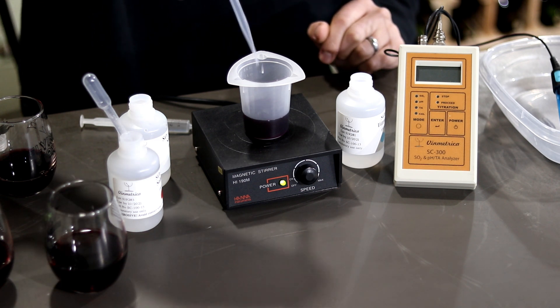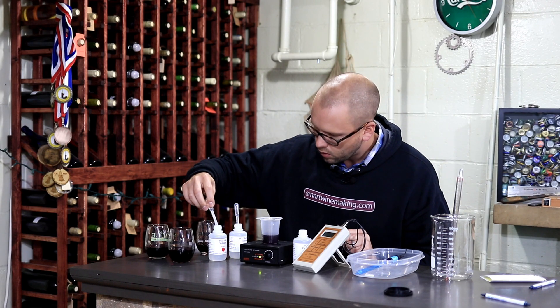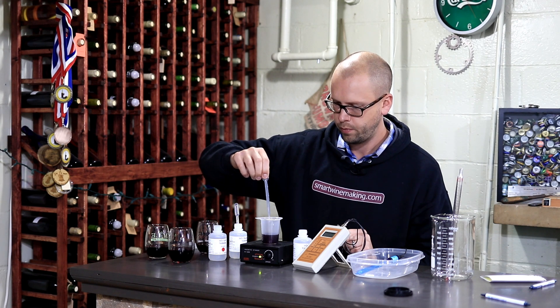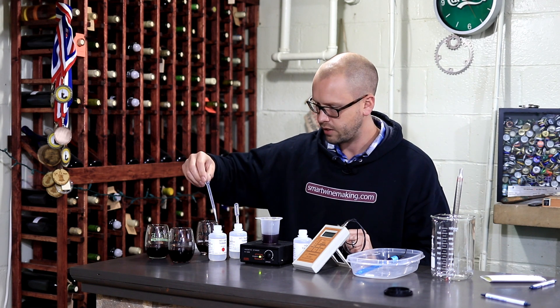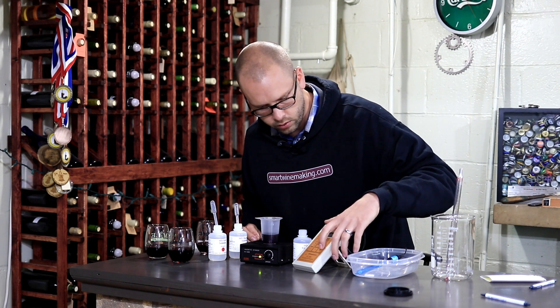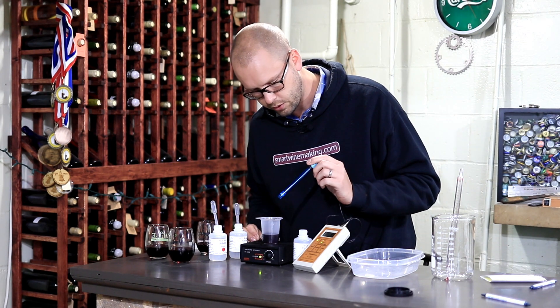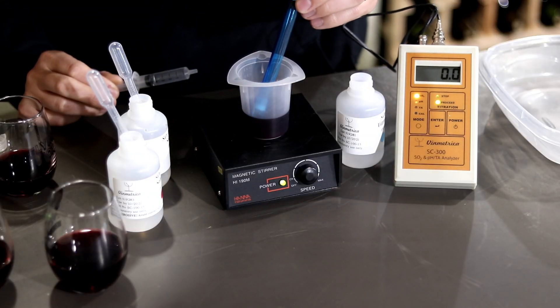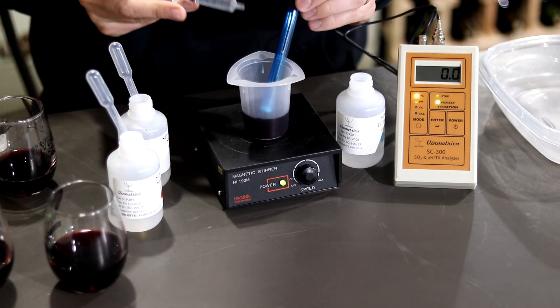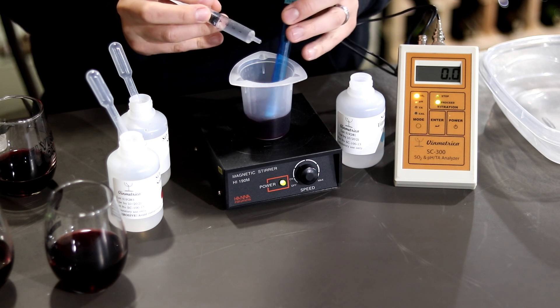This is one of those tests where you don't really have to be exact on the reactant and acid additions — you just want to have enough, so about 2 milliliters of each. Add a bulb of reactant and a bulb of acid. Then we can start titrating with the titrant. First, turn the meter on — it says SO2, which is where you want it to say.